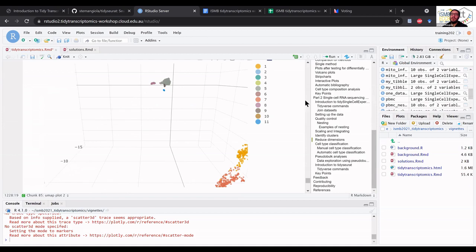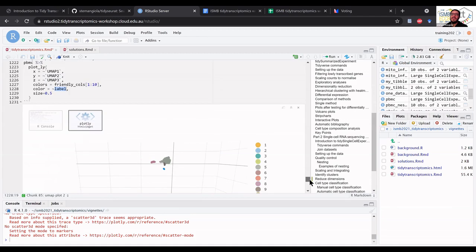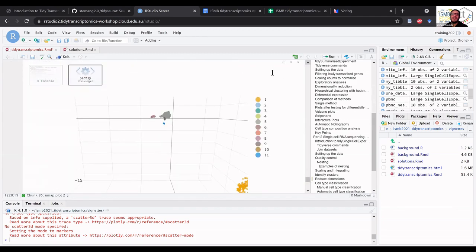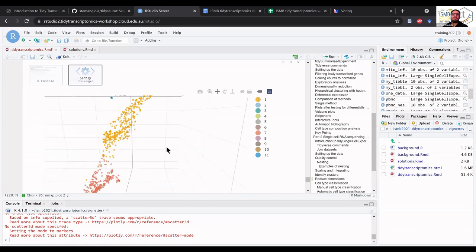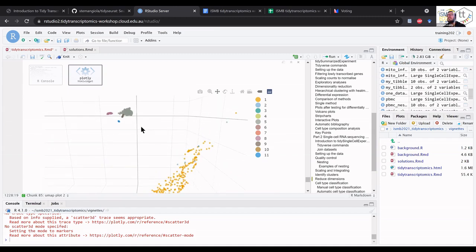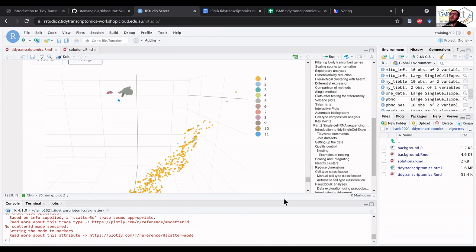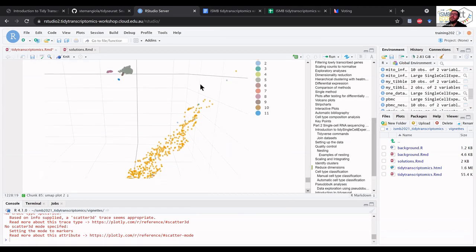Now my screen is very raw, low resolution. Of course, normally it's much easier to do this, but you can pan and explore these plots at your will. Very interesting. I found some relation and heterogeneity for the clusters that was not very obvious in 2D. In 3D, some relationships become much more obvious. So I suggest you explore this possibility.